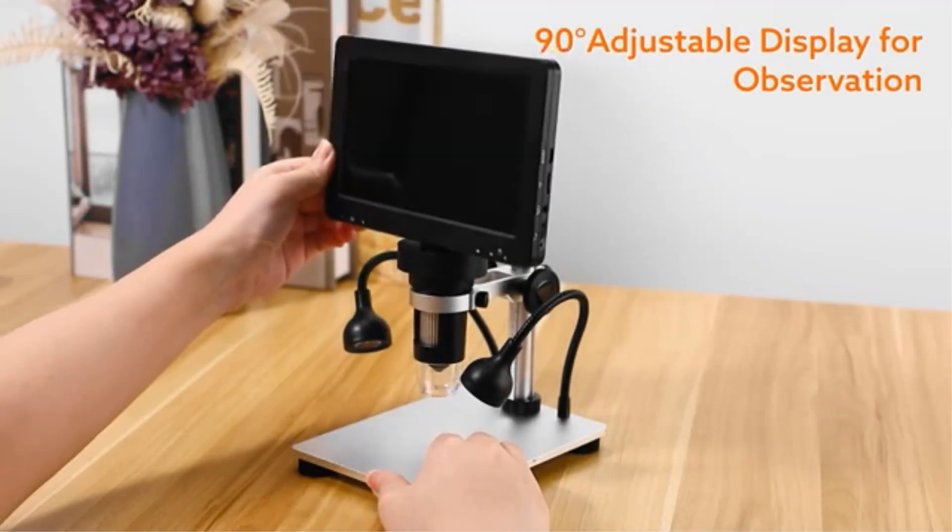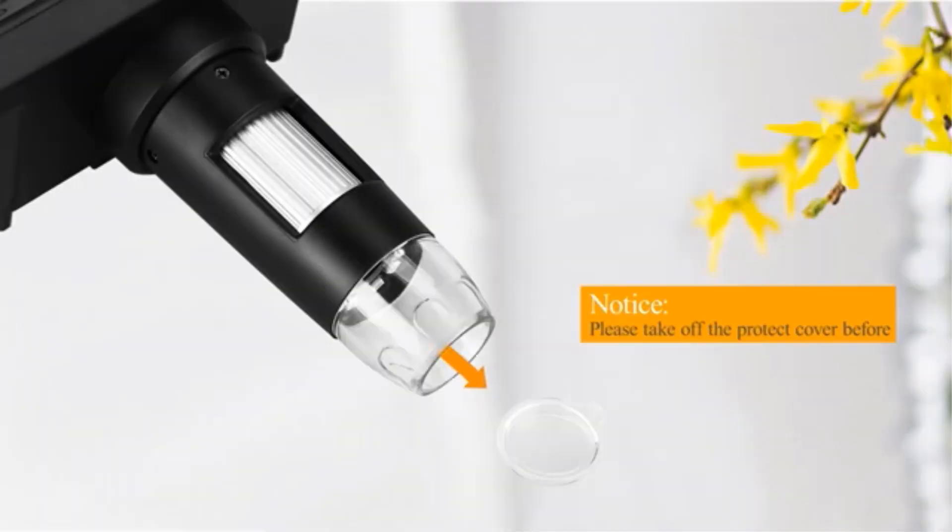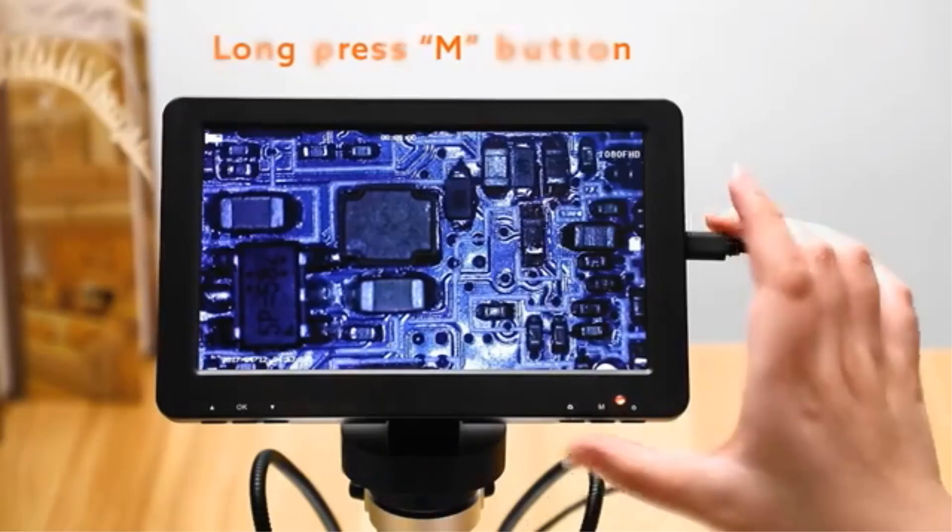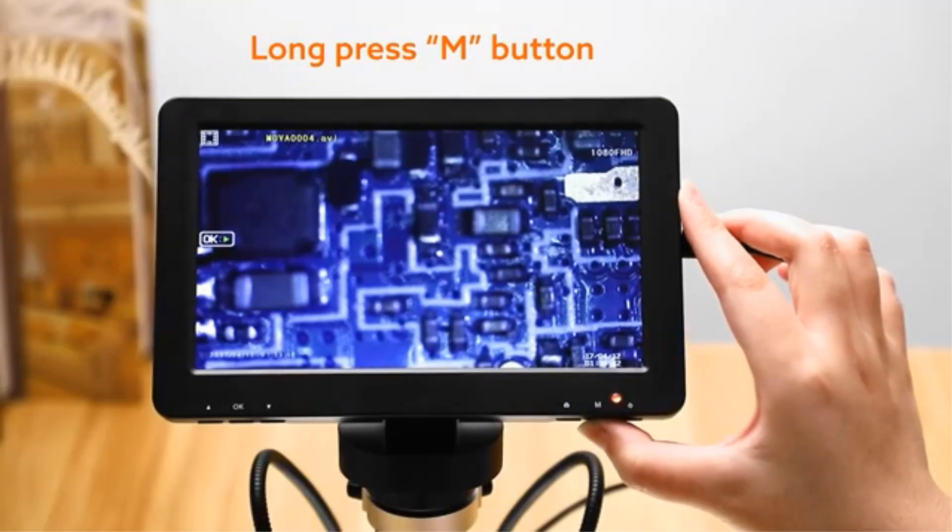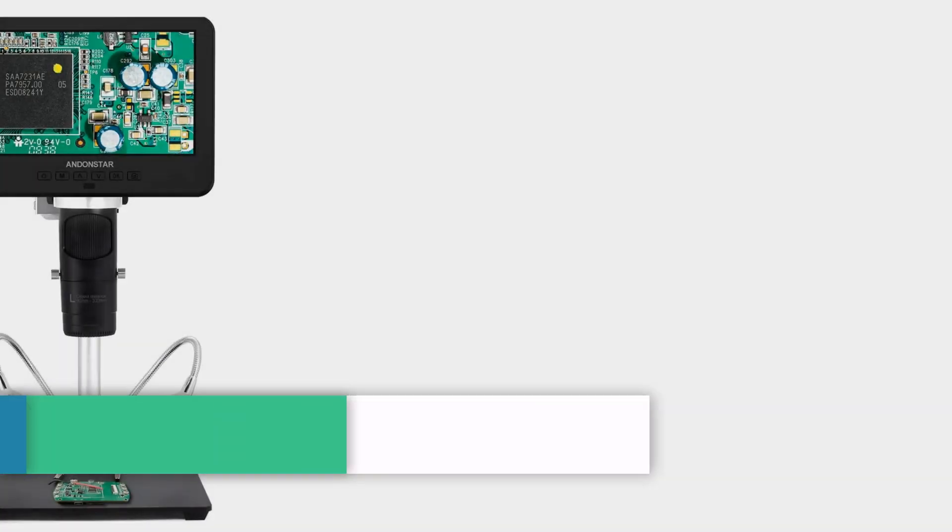Its applications span across hobbyist electronics repair, scientific observation, and educational uses, making it an ideal gift for those interested in microscopy.